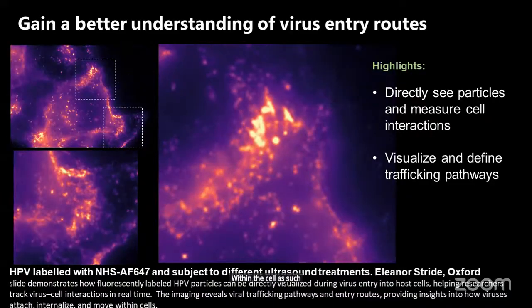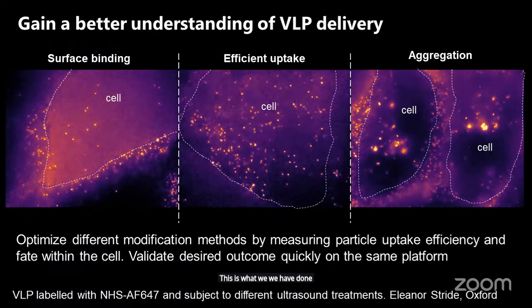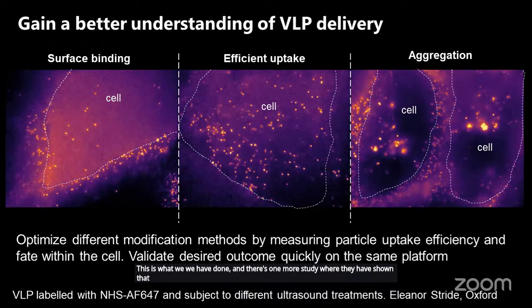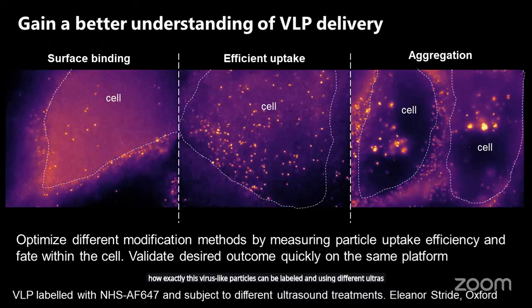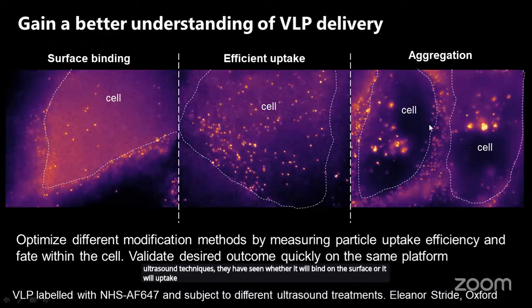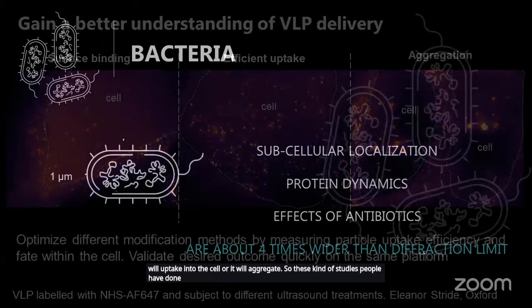So this is what we have done. And there's one more study where they have shown how exactly virus-like particles can be labeled, and using different ultrasound techniques, they have seen whether it will bind on the surface, or be taken up into the cell, or aggregate. So these kinds of studies people have done using our microscopes.